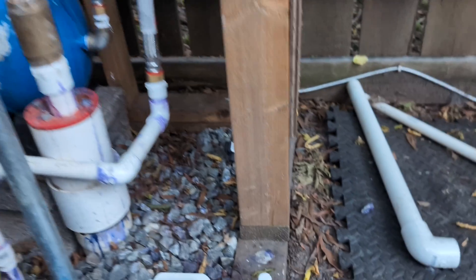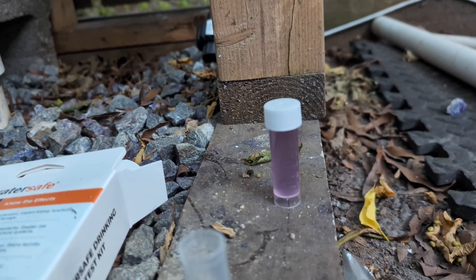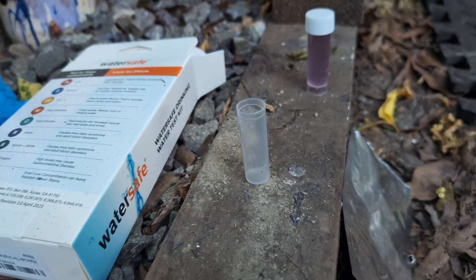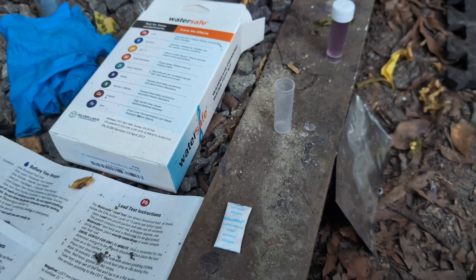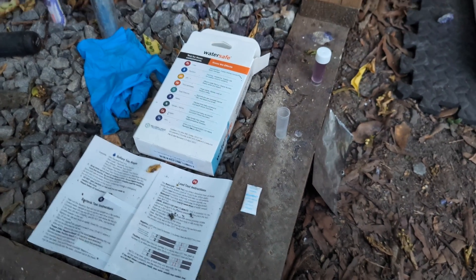All right, we're two days later. This thing has not moved and it is still purple. The results are in — purple is good. This test did not find any of the bacteria that it's testing for, so good news all around. I'm not sure what all this means, but the water looks pretty clear and it actually doesn't taste that bad.